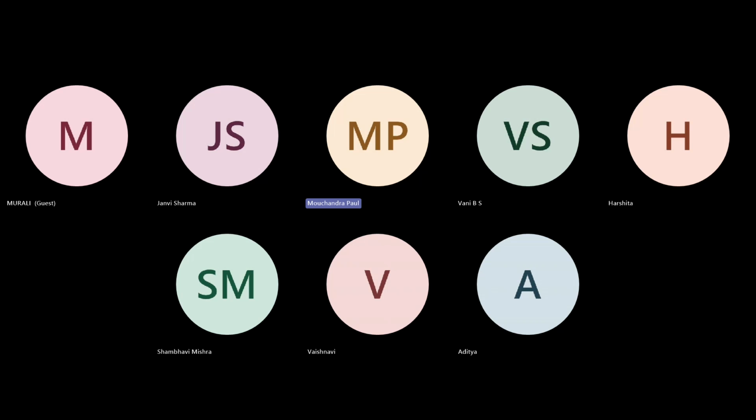So the first, very general thing that you will have to do when you're trying to make a tissue construct is to define how many cells you want to put on your artificial matrix. That means you need an exact cell number. So how will you count the cells? That is what I'm going to discuss.